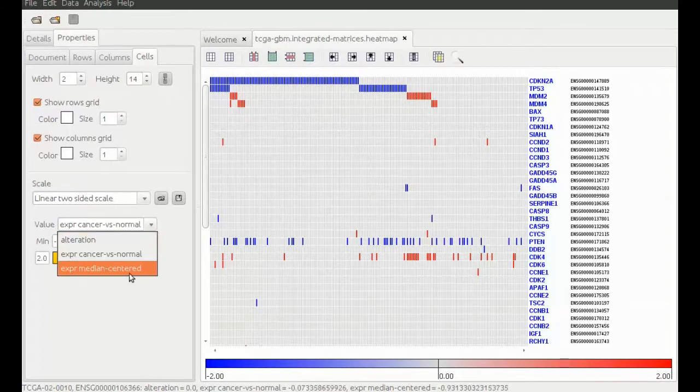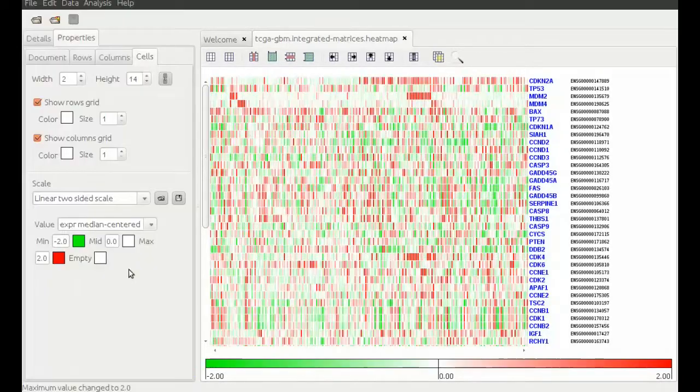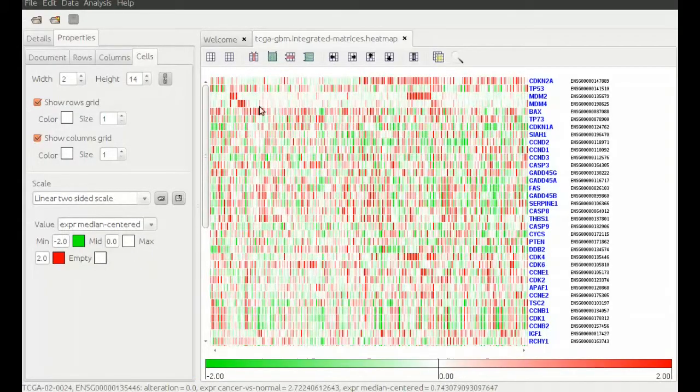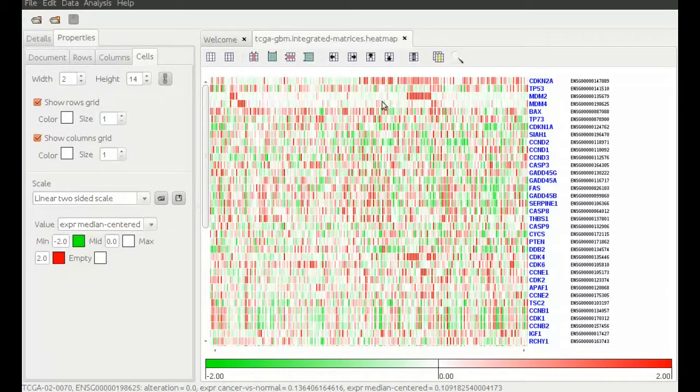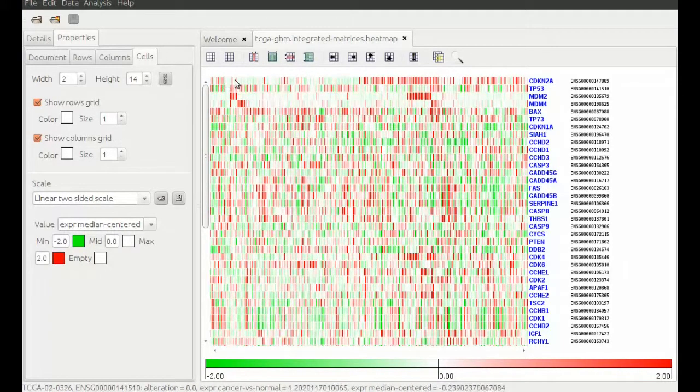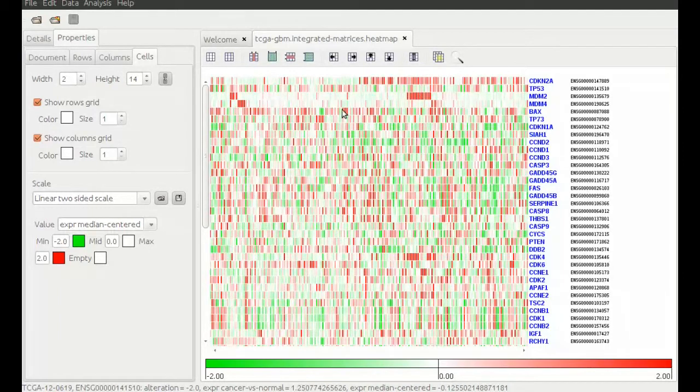In the expression values we can see the effect of gain of the genes MDM2 and MDM4 as well as the loss of CDKN2A and TP53.